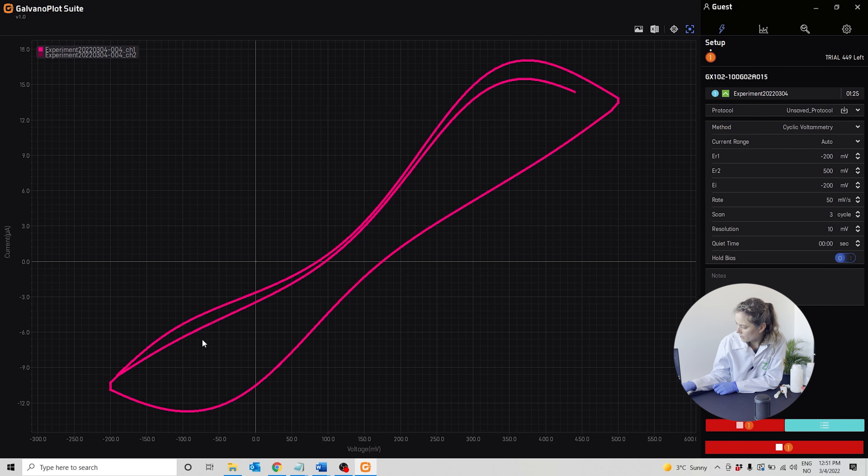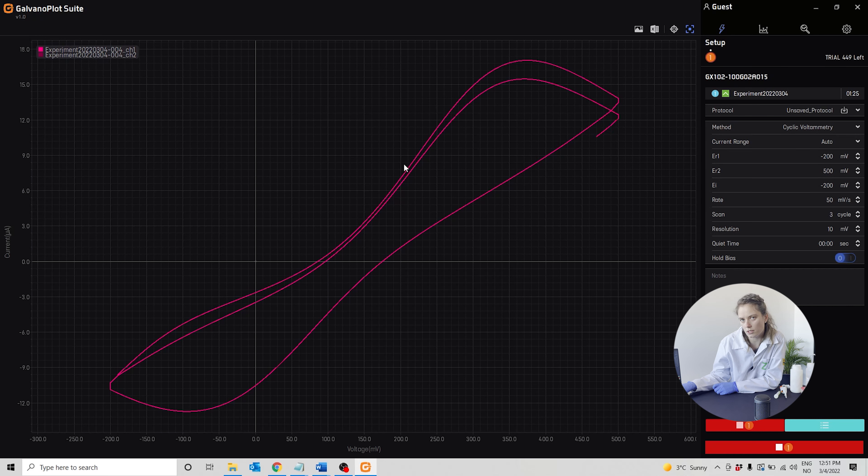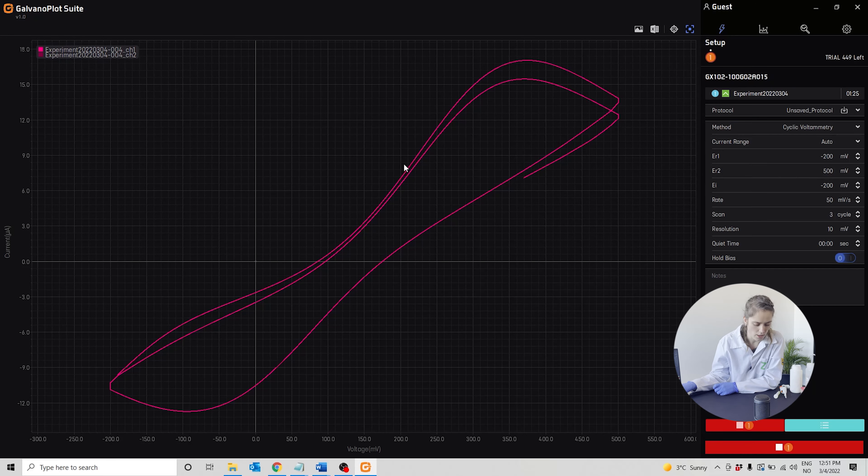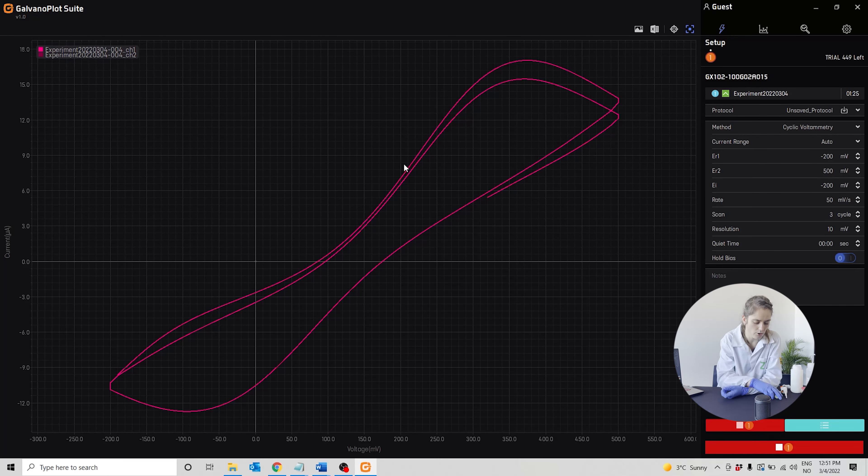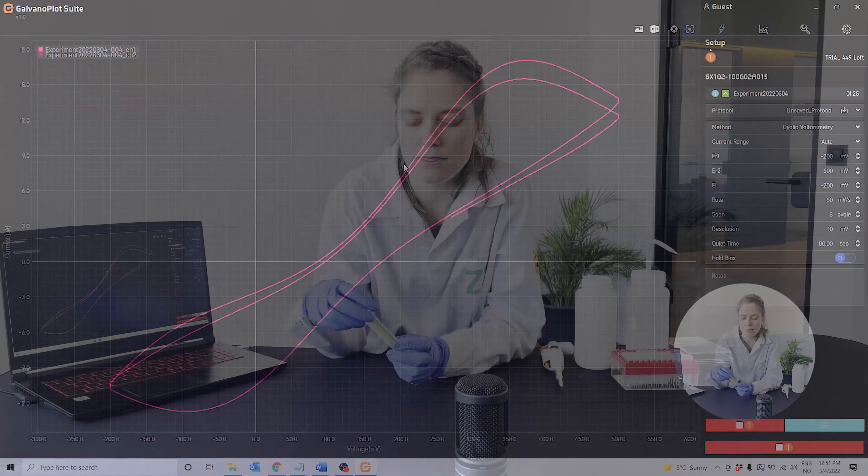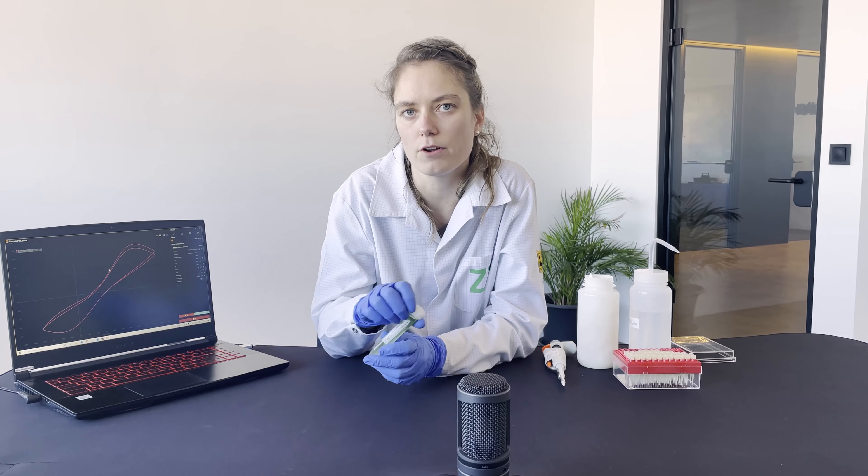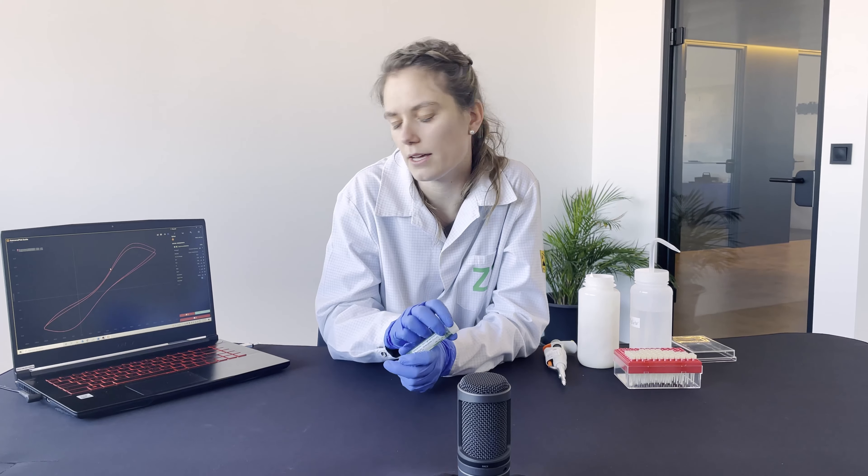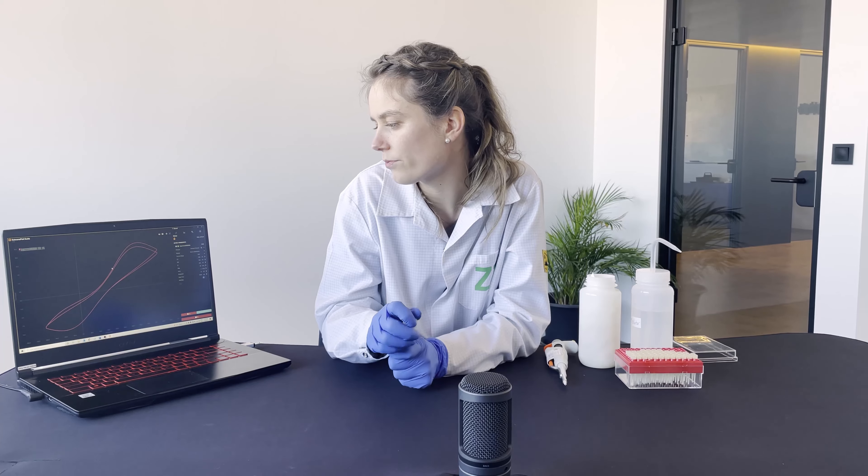It does this three times, oxidizing and reducing the iron in the ferri-ferrocyanide solution.